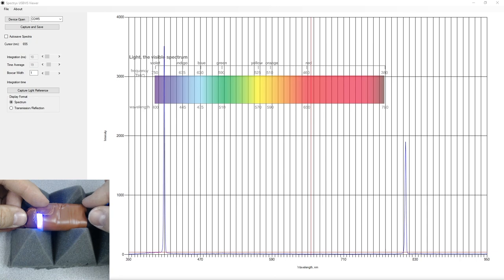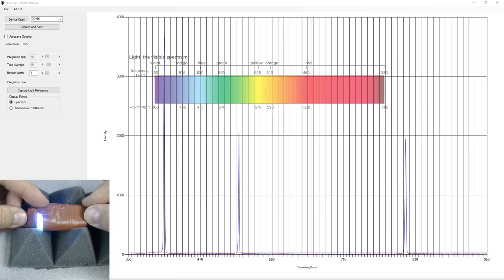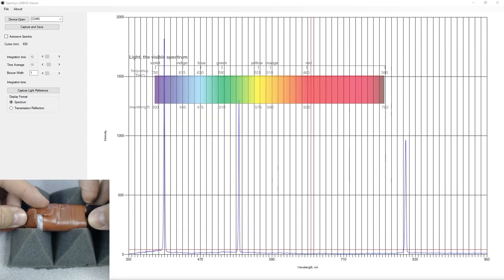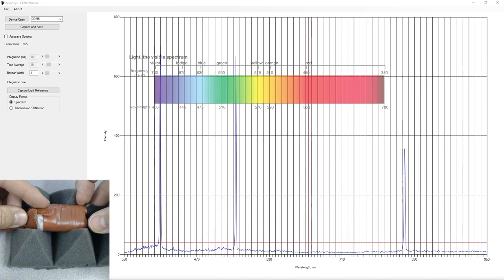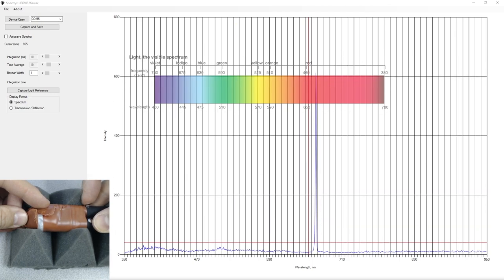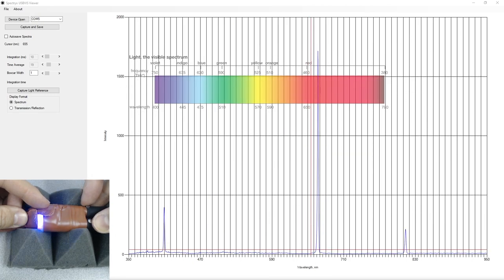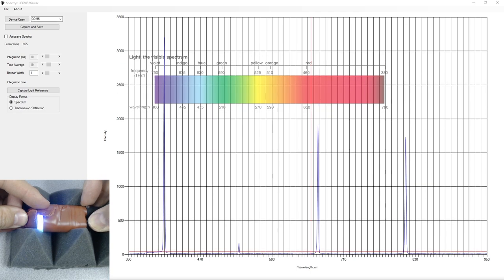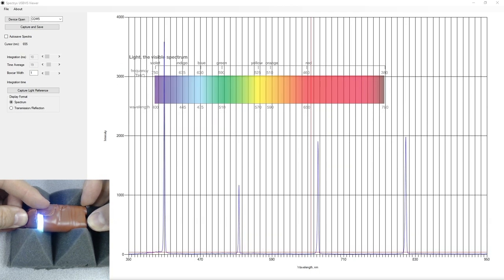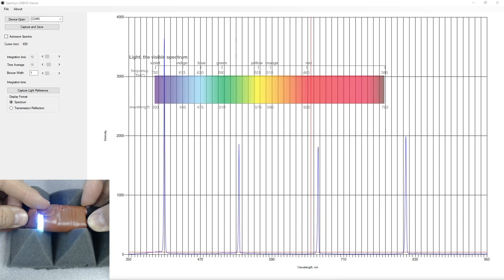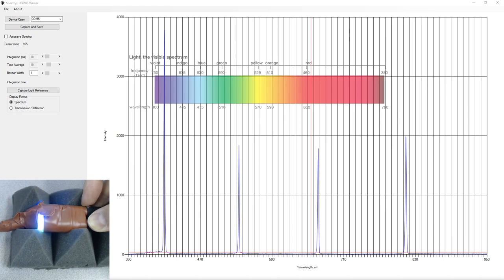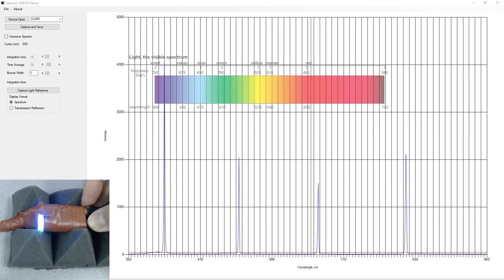So what we'll try and do is I'll turn on multiple ones. So this is the blue and the green. Okay, and I'll try and turn on the red if I can get around there and turn them all off. I'm going to turn them all on. So this is the red first. And the blue and then the green. You see, they're nice tight lines. Really tight. So I think I overdid it with removing the aluminium foil mask from the blue there. So it's a little bit high. Anyway, they're nice sharp lines.